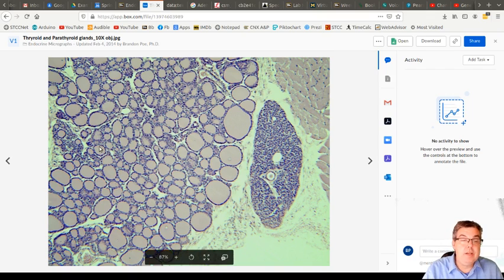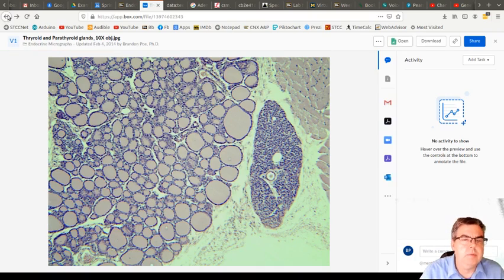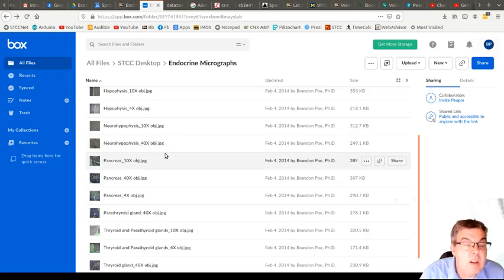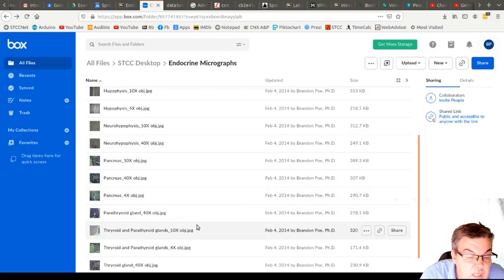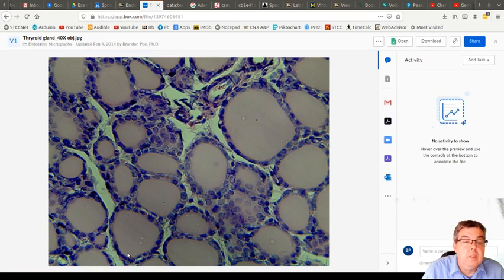If we were to zoom in on that tissue, which I think I have a slide of, oh, come on. Thyroid gland, 40X. Okay, so again, can't be positive, but these are most likely parafollicular cells. Or these are kind of my expectation, what I'm talking about.